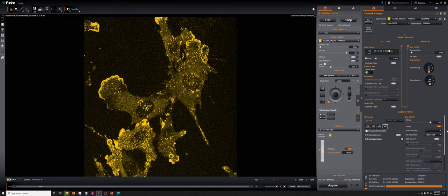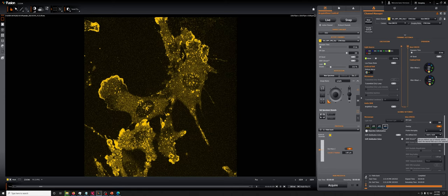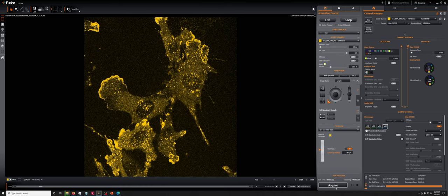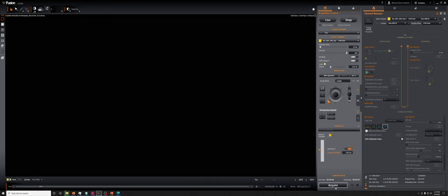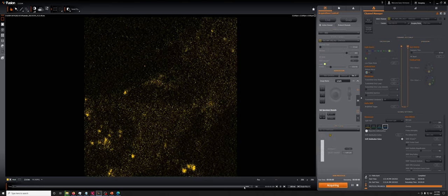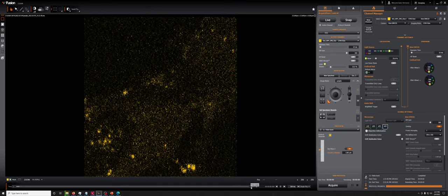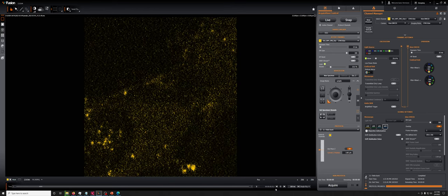So one of the first options is to crop. So if we crop down to, for example, 256 by 256, and we run the same thing again, there's an extra 29 milliseconds that we're trying to reduce here to go as fast as we possibly can. If you crop, you can see that that goes down to just one millisecond.